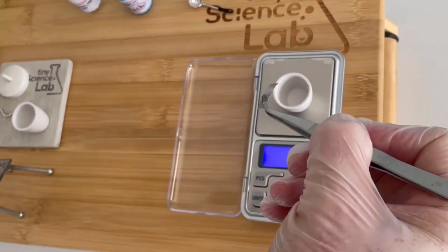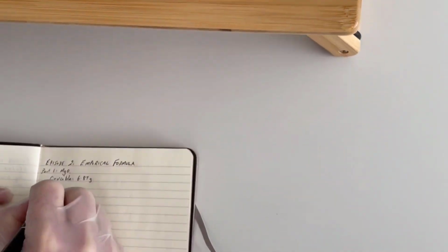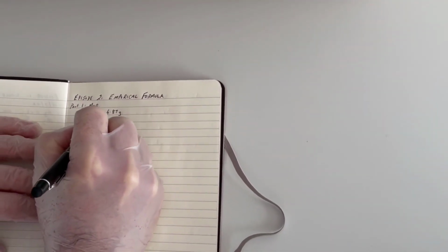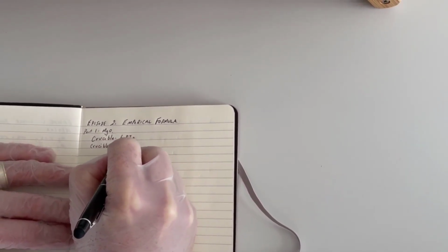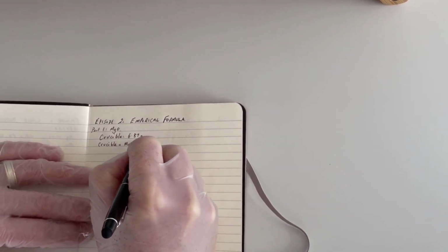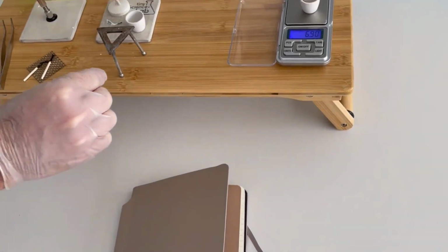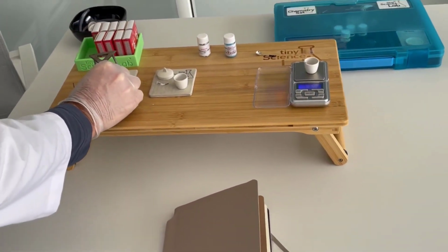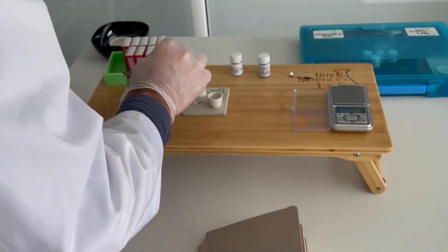So now I'm going to add my piece of magnesium. So crucible plus magnesium is 6.90 grams. Okay, so what we want to do now is heat the crucible with the magnesium.